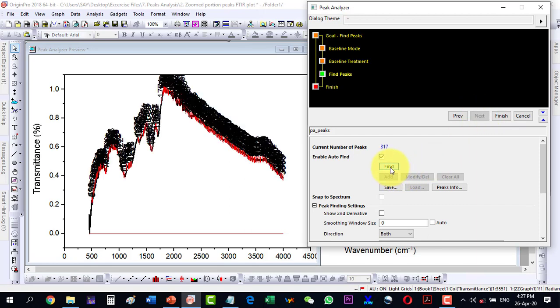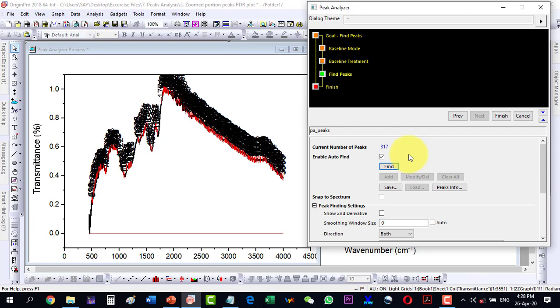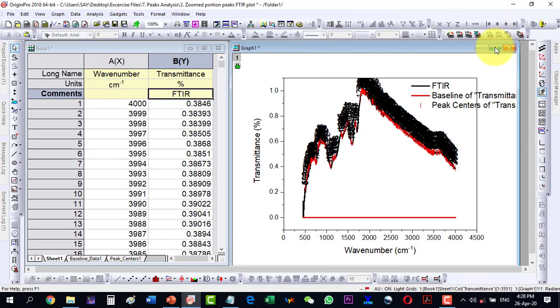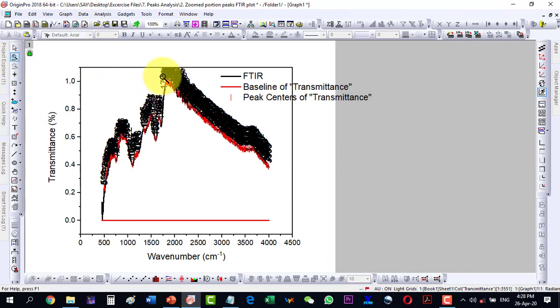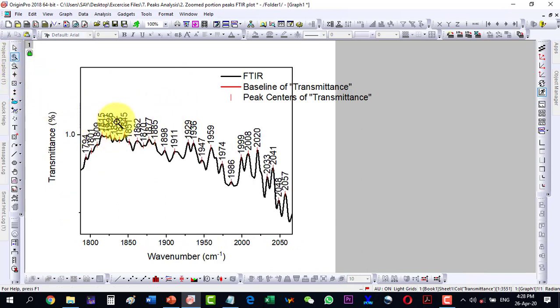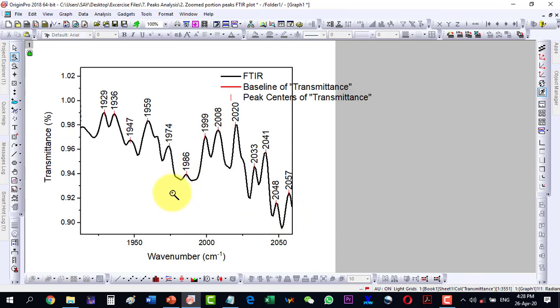Now clicking Find, you see that it has found up to 317 peaks — they are almost not readable. But if I select the zoom option I can see that all the peaks have been found accurately. After finishing, if I zoom into a portion I can see that it has found peaks for almost all the oscillations over there.